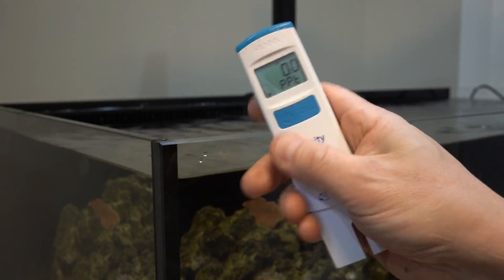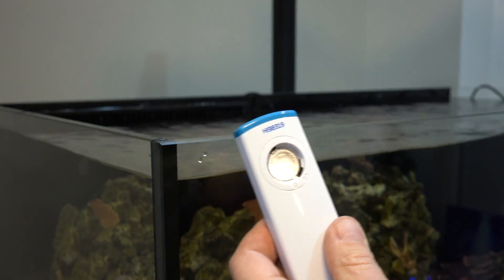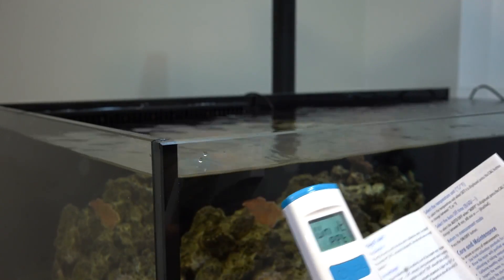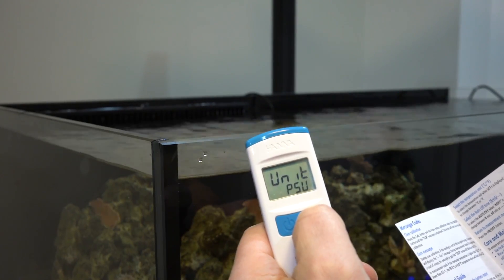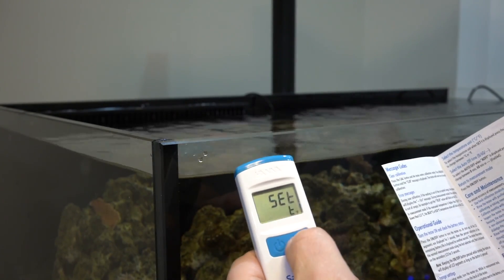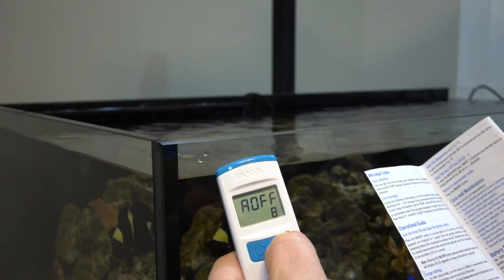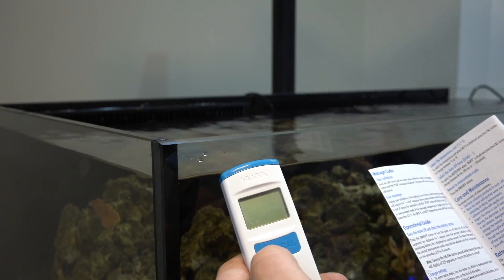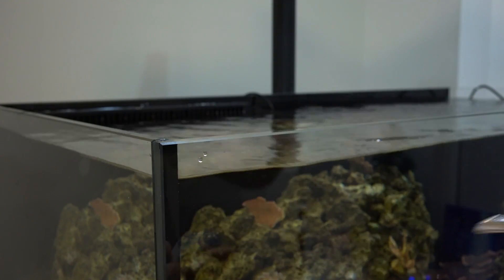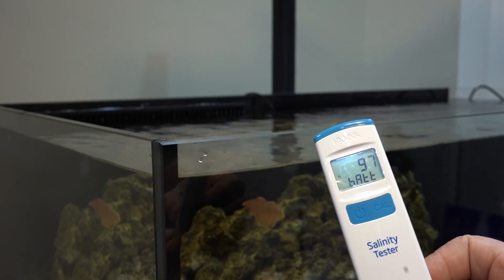One of the disappointing things about this is changing the settings. I hate going to the back here and pushing the button. Although, how often are you going to do it? But if you wanted to, it's just kind of a pain. But once you do it, it's quick and easy. I changed to specific gravity and then to Fahrenheit. There's an auto-off timer — you can change the duration, I didn't mess with that. So quick and easy, with a little battery cover that goes back there. Nice, simple, easy little device. Quick to power on.